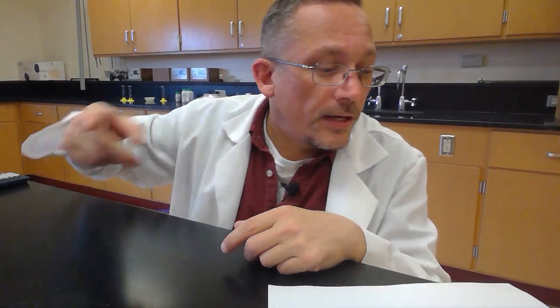So was that pretty close? I said it was pretty close to 5. And Google says it's 5.5. So I'd say that's pretty close. I think we're a little bit low there, but that's all right. It's pretty close. And let's see, that looks like that is the lab. So that's it.